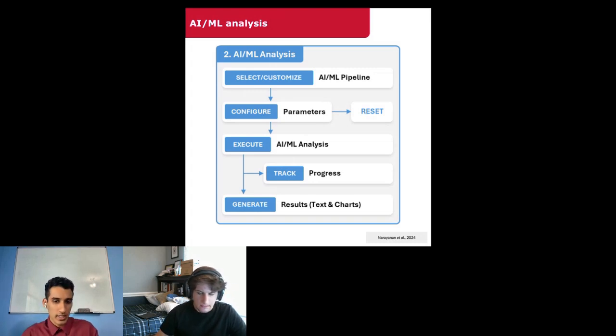Will already did a fantastic job explaining the architecture of IntelliGenes, so I won't cover it again. But at a high level, IntelliGenes, again, has a dual phase analysis where first we do a selection algorithm where we select relevant features in predicting the disease state. And then finally, an ensemble of machine learning classifiers that are used to actually predict the disease state, which we aggregate together with a voting classifier.